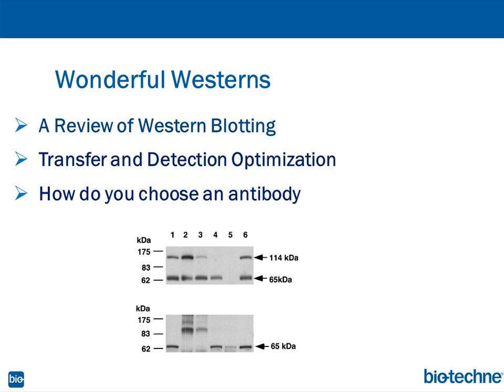Second thing I wanted to mention is if what you're doing now is working for you, and you're getting great signal and low noise, and your 150 kilodalton protein is transferring wonderfully, and your small 10 kilodalton low abundant protein is lighting up very nicely, and you're getting low background, you know what you do? You stick with what works. There's no reason why you have to follow everything that I'm suggesting.